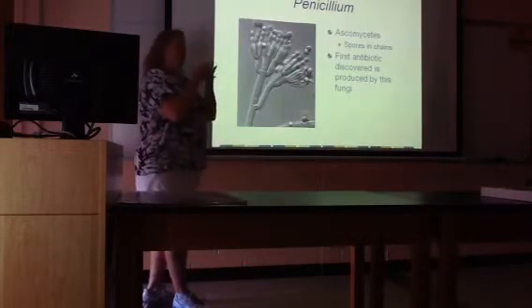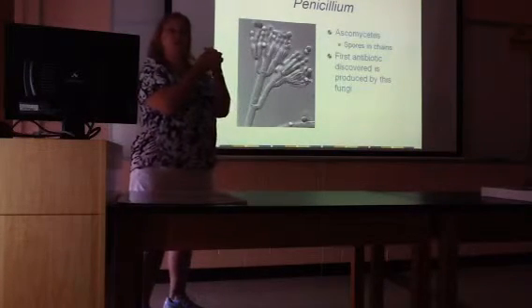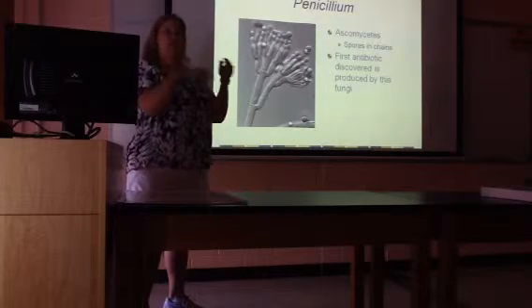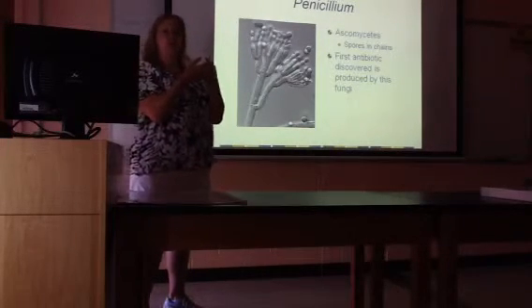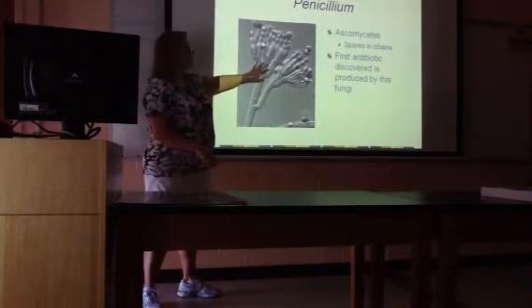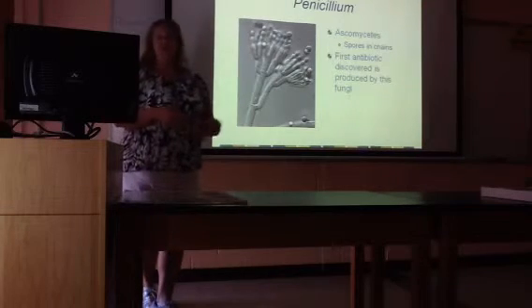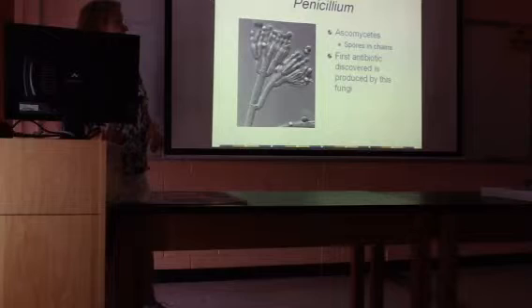Also remember, fungi are all growing on top of each other, so you're going to see a big ball of pink or a big ball of green. Make sure you're going out to the edges of it in order to be able to see individuals. So piled on top of each other in the middle, you're not going to be able to see broomsticks. So make sure you're out at the edges of that clump where you're going to see these. Doesn't cause any human diseases, but our first antibiotic was found from the fungus.